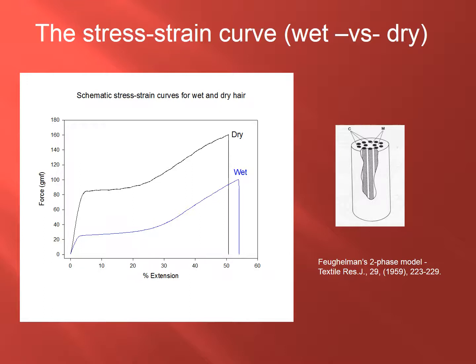And also those who regularly perform such testing recognize that considerably bigger differences almost always arise when samples are tested in the wet state. In short, wet state tensile experiments just provide better sensitivity. And for this reason, I suggest that the vast majority of all tensile data that we encounter consists of wet state break stress results. And what I hope to show you in this presentation is that while this parameter does indeed work very well, there's also considerably more insight that can be obtained from consideration of these other parameters as well.